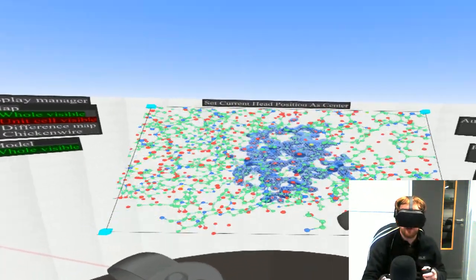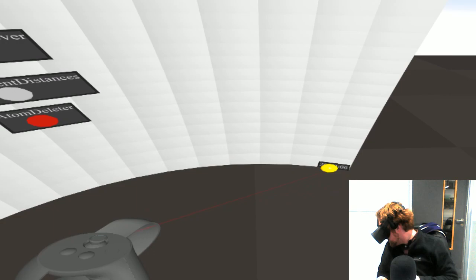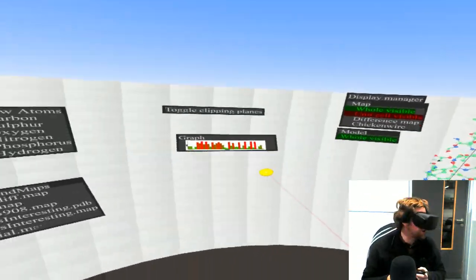Let's, what other bits? I've got pick these up and move them around on the panel. With this button, but the buttons are quite contingent. I might change quite a lot of them.